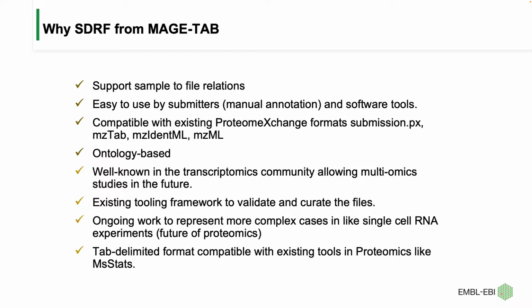Why SDRF? We looked into multiple options, and SDRF is actually not new. It came from MAGE-TAB, for the microarray and RNA-seq data community. It is part of the MAGE-TAB file format, which is extensively used in transcriptomics and RNA-seq.